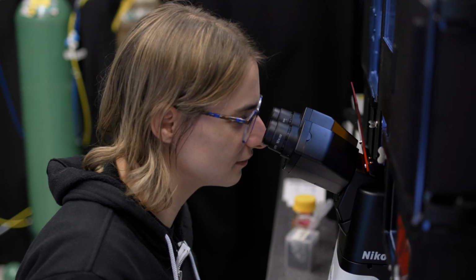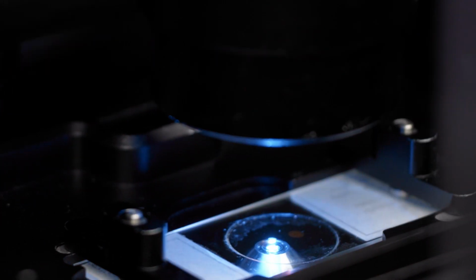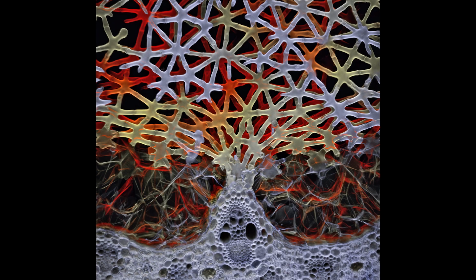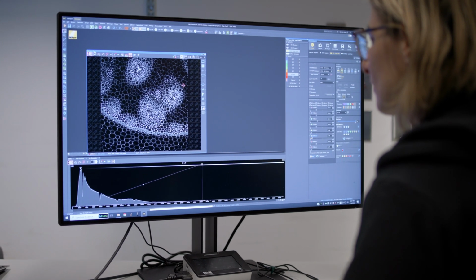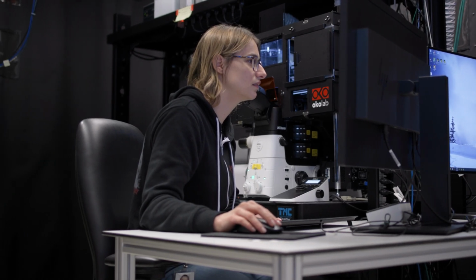Now, if you want to capture the entire volume of the 3D biological sample, it's very easy. Actually, all you have to do is move the sample stage. Now, a different layer of the biological sample is confocal with the pinhole. So upon moving that sample stage up and down, you can capture the entire height of the sample. Now the software can digitally put the entire 3D volume together, creating a confocal stack, which is your 3D data.